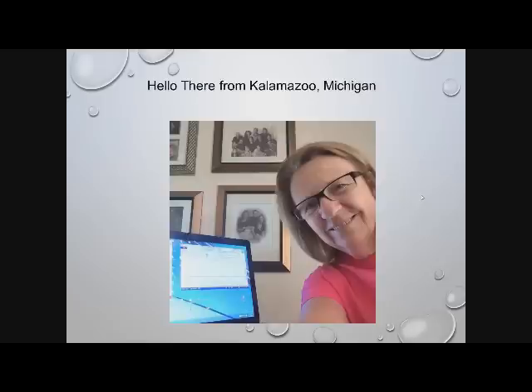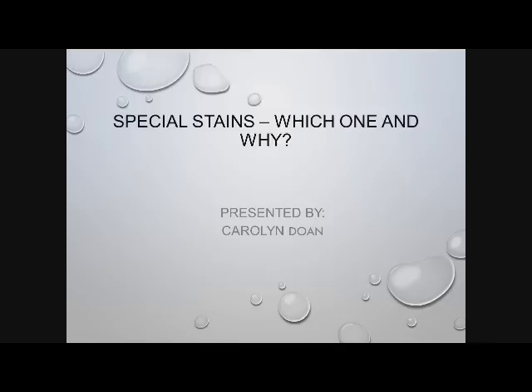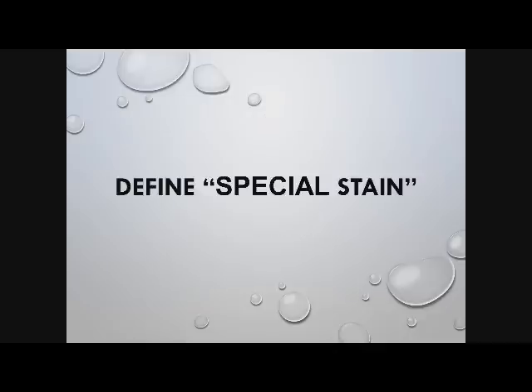Look, today we'll take a close look at some of the most common special stains. We're going to learn why and on what we might use them. We're going to look at what happens during some of the processes, and I've thrown in some generic protocol and troubleshooting that I gathered from folks just like you throughout my years of work. Now, if you have any comments or questions, just jot them down, and we'll share them at the end of this, okay? But anyway, we're going to get started. We're going to define special stain.